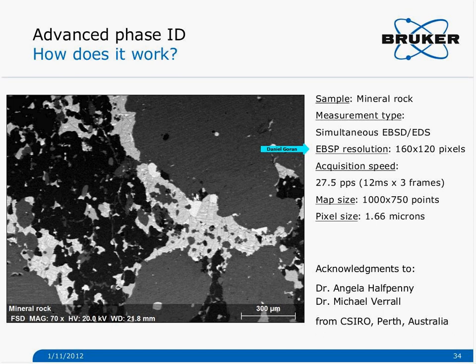For this, they were actually not prioritizing the speed, but were prioritizing the quality, and they launched the measurement in the evening. So what they did, they used a 12 milliseconds exposure time and 3 frame averaging for the EBSD data, of course.